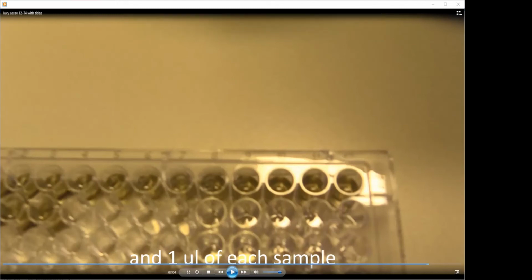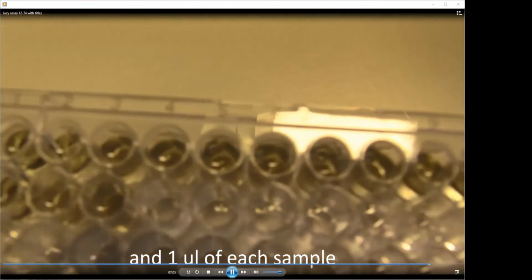Why this small volume? Because the problem is that this lysate buffer containing Triton X-100 in fairly high concentration, 2% of Triton X-100, interferes with this reaction. So it's also not an optimal normalization procedure. For the future, I have to think about a different technique to measure the protein concentration to avoid the interference of the lysate buffer.